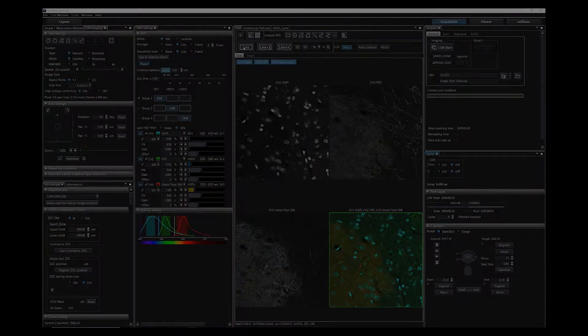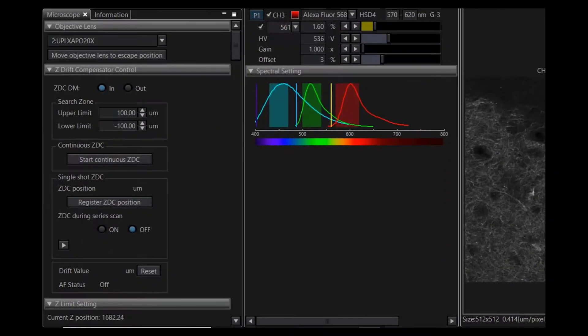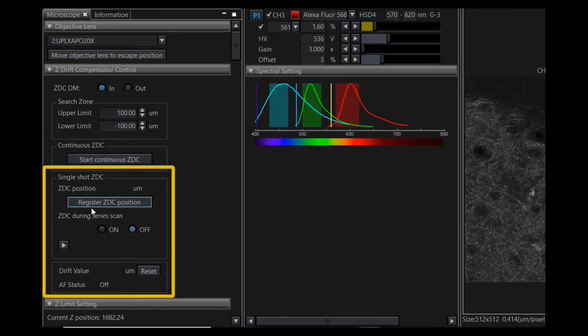To enable single-shot mode with the TrueFocus ZDC module, click Register ZDC Position. Wait for the beep to confirm the proper Z position has been found. Next, select On under ZDC during series scan.